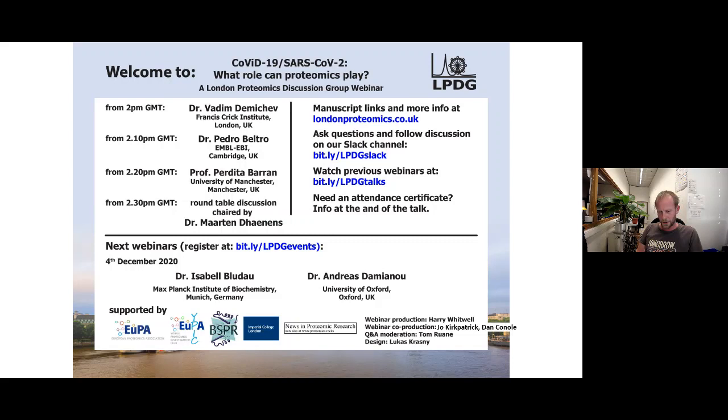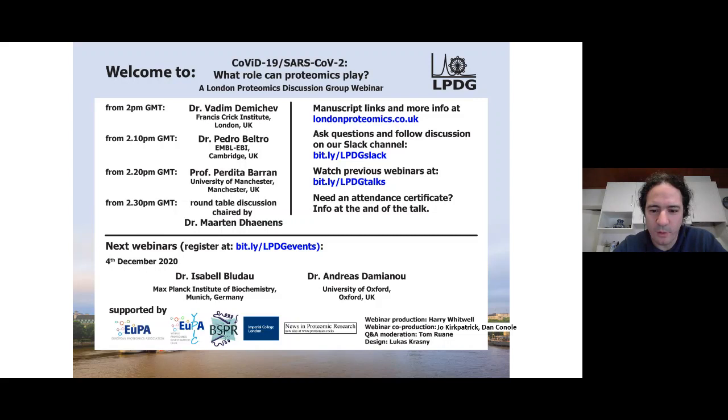Yeah, so these are Caco-2 cells, and compared to mock infections they show a very pronounced increase in the filopodia when you infect with SARS-CoV-2. Filopodia formation, or these tubular extensions, have been shown for other viruses like the Marburg virus as an example. The why this happens is not clear. The how is also still not clear.